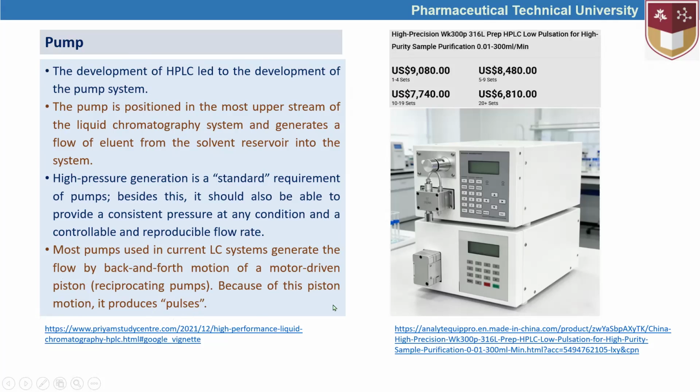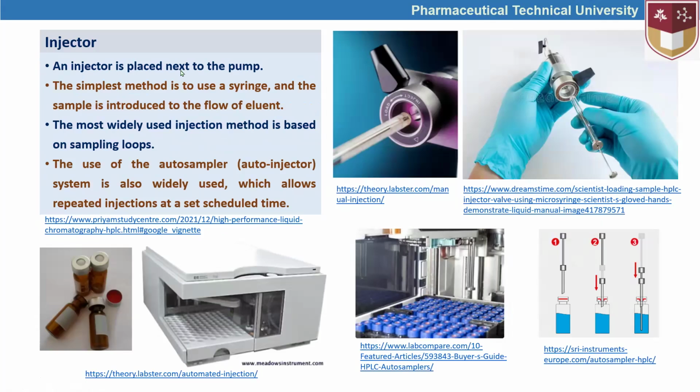In the classical liquid chromatography systems, we could see different sending pumps like peristaltic pumps, and the system of the HPLC is very precise. They are not comparable with those ones. They work very precisely. That is why we can rely on the precision of the HPLC.